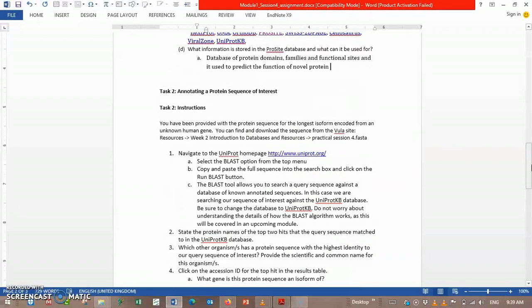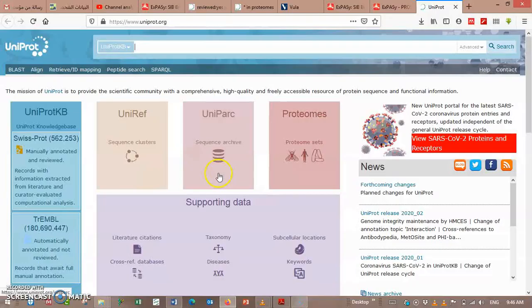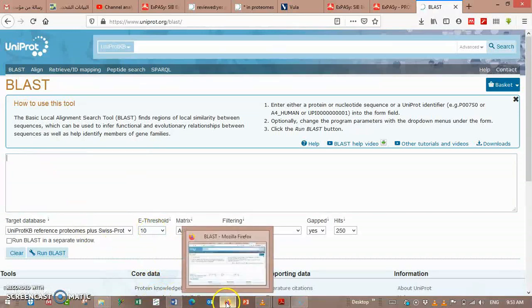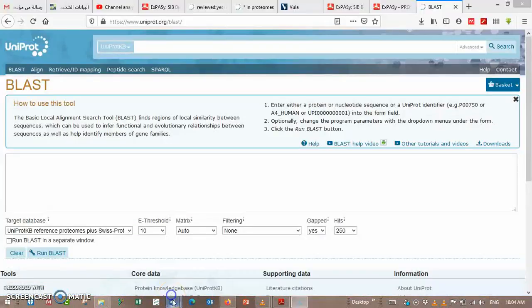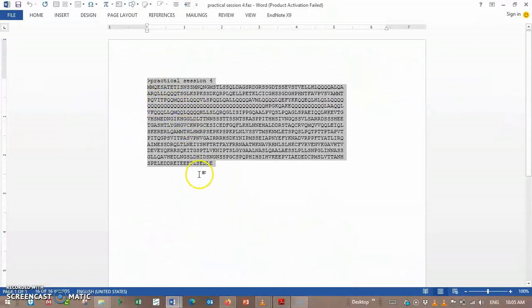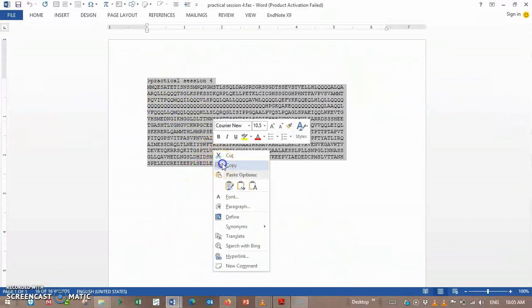You have been provided with a protein sequence for the longest isoform, called from an unknown human gene. You can download the sequence from the Vula site and navigate to ProSite. Then paste the sequence of the protein provided by Vula into ProSite and run the search.